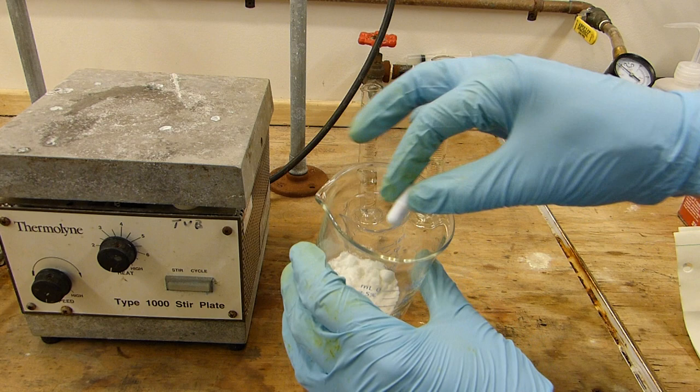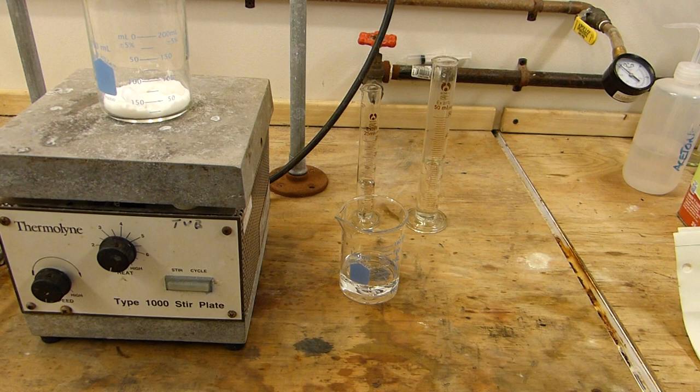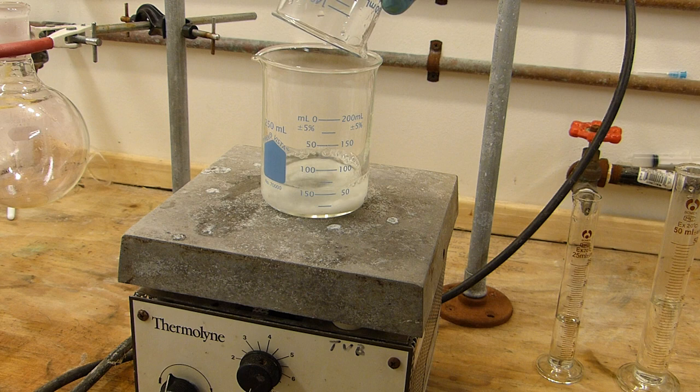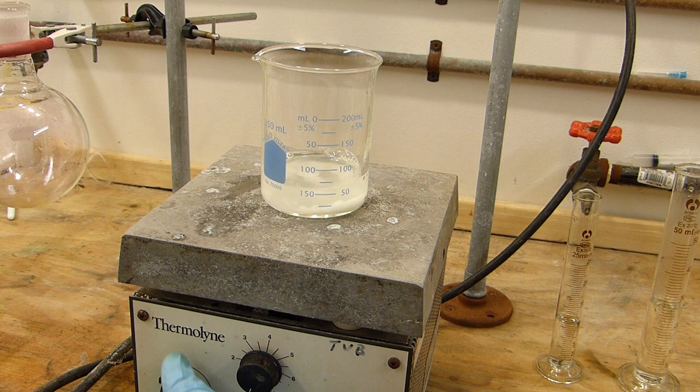So I'll start by placing the stir bar in the potassium iodide and we'll get this stirring on a plate with the water. Potassium iodide is very soluble in water so this won't take very long to dissolve.